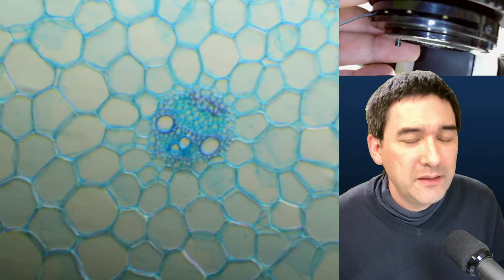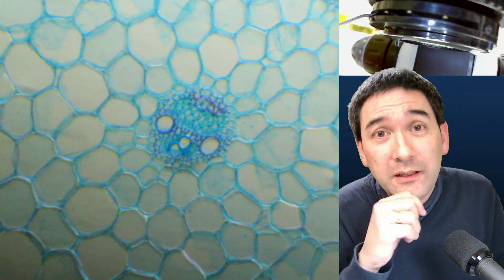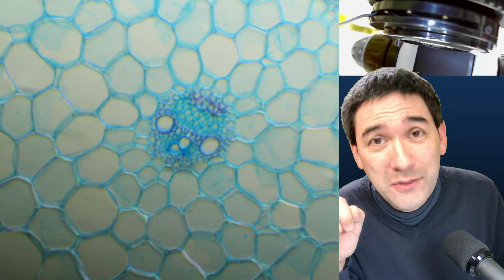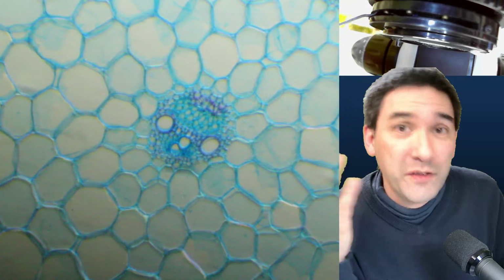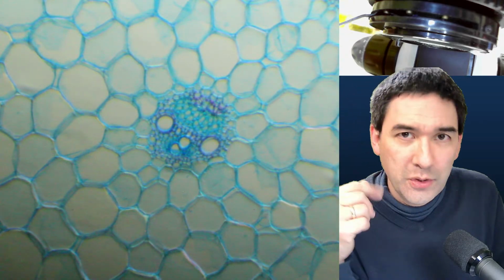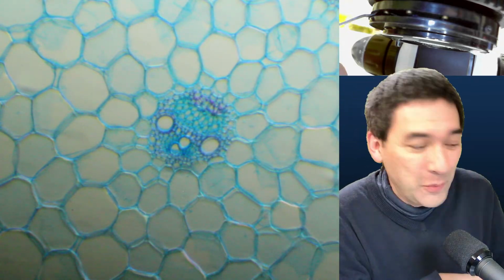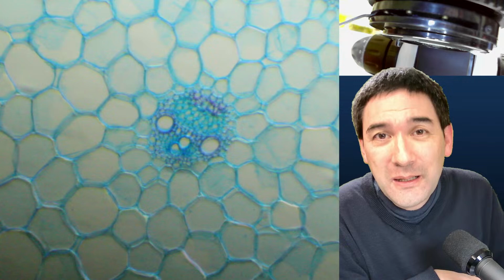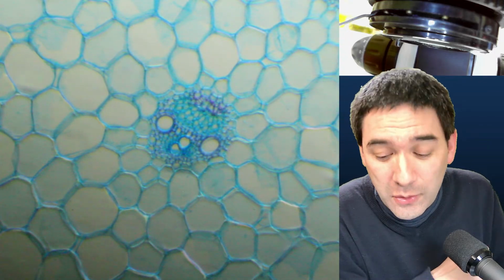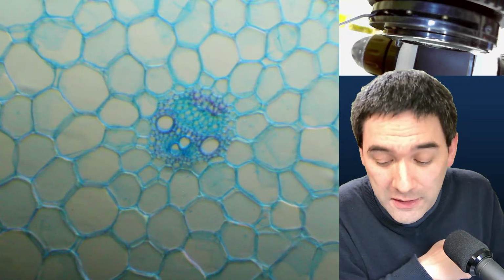Yeah. And this was the starting point for me, where I said, evidently, the difference in refractive index between the specimen and the mounting medium is quite important. Obviously, it is, right? So what I decided to do today in the morning, around 12 hours ago, morning from my time, right now where I am it's evening, I decided to use some pollen that I collected some time ago, and I tried different mounting media to mount the pollen, to make permanent mounts.